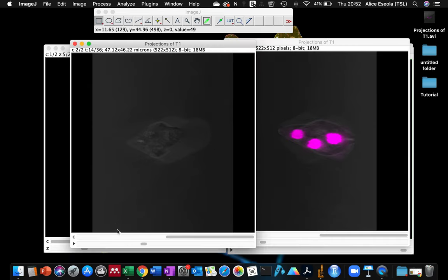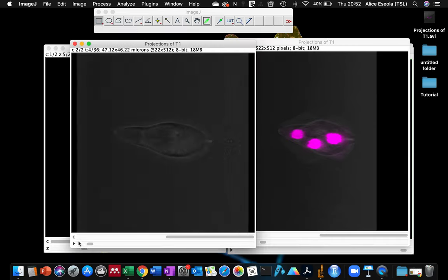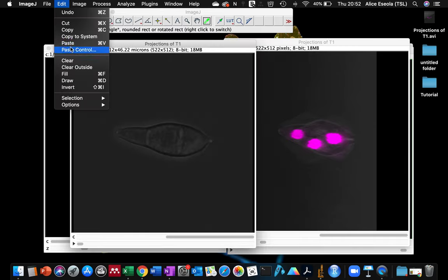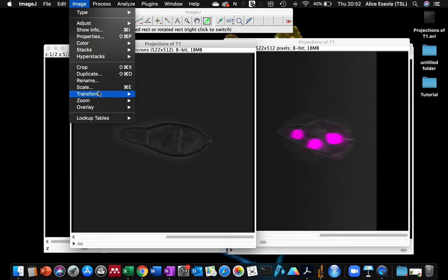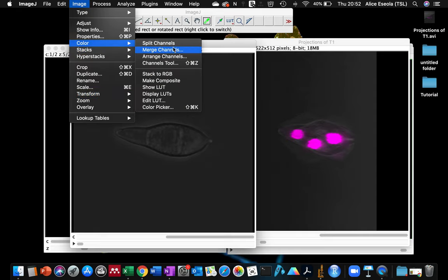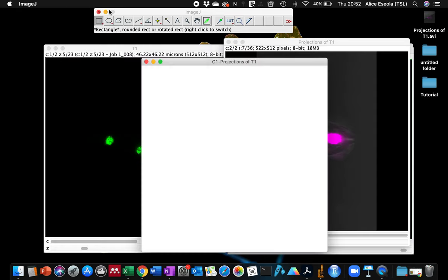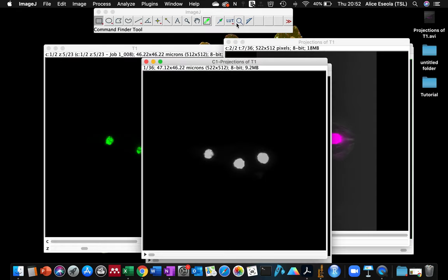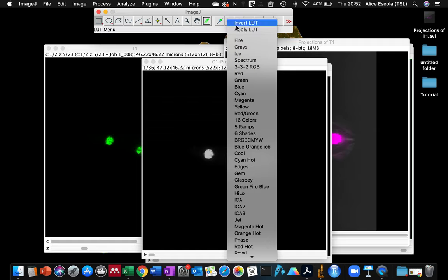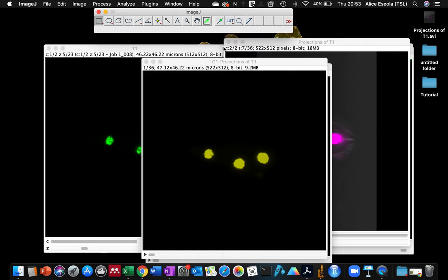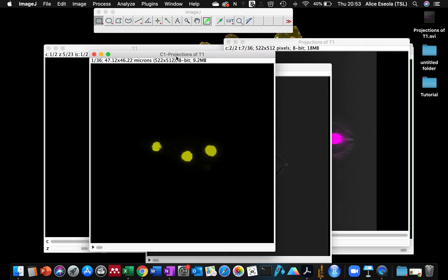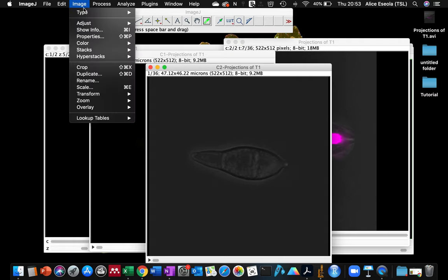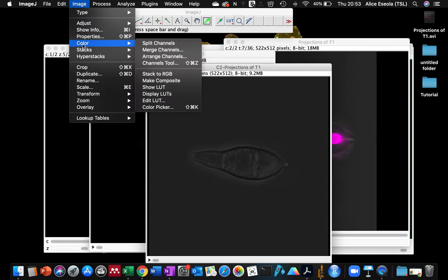Okay, I'm also going to split this, give it a color. This time around let's choose a different color, yellow.